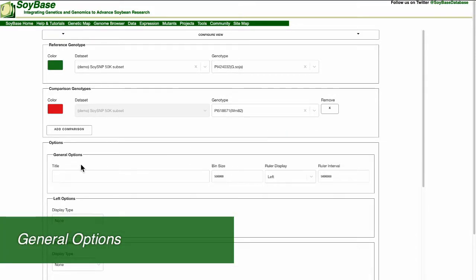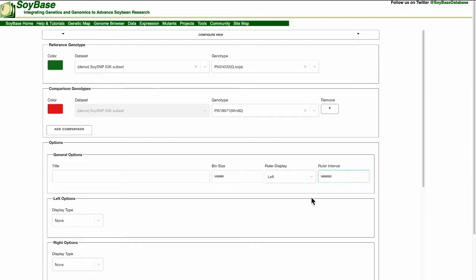First are the general options which include title, bin size, ruler display, and ruler interval. I am going to fill in the title box with test demo and continue with the default options.